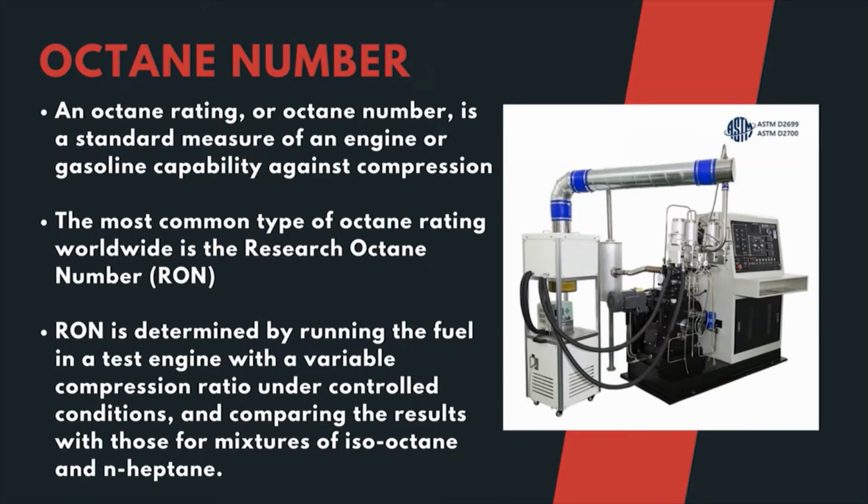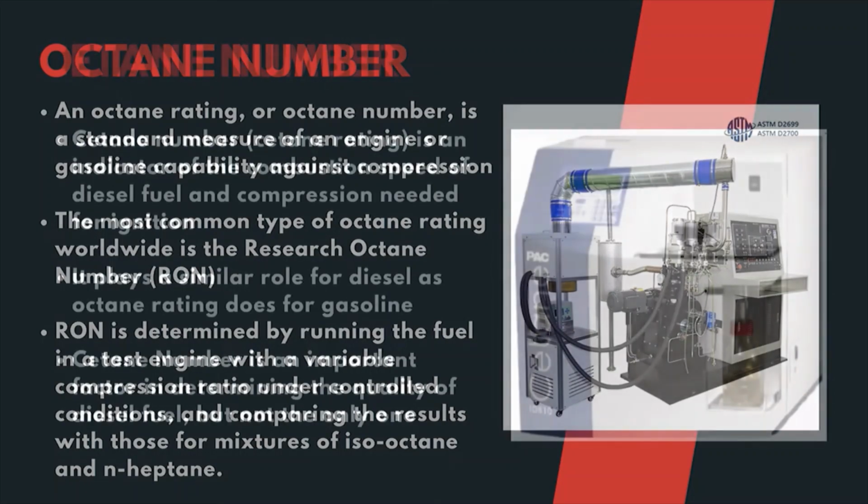So, isooctane and N-heptane are the extreme octane numbers, and when you take a sample, we are trying to figure out whether it is being compared with a specific mixture of isooctane and heptane, and finally the octane number is reported, and it is done using the octane engine.